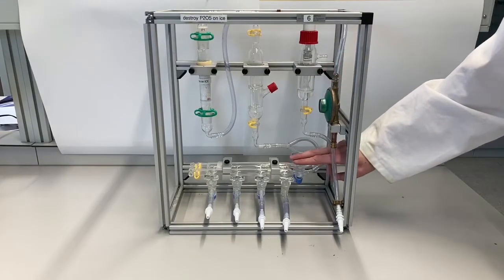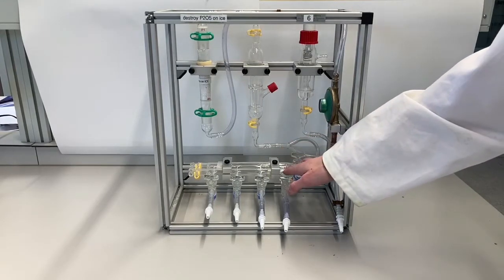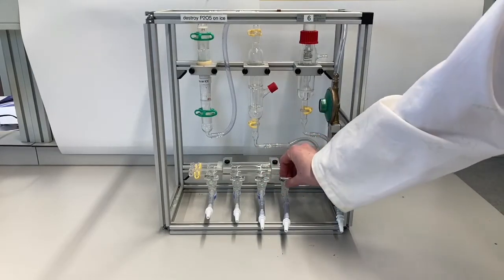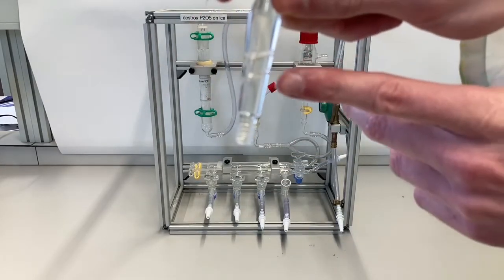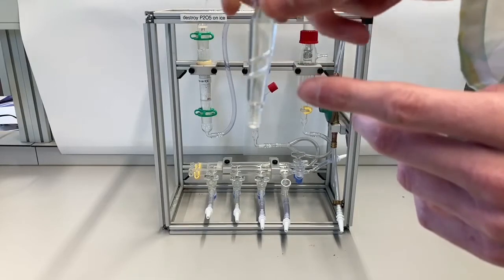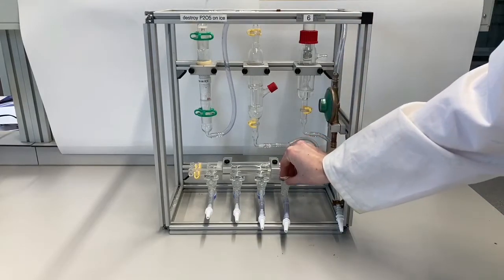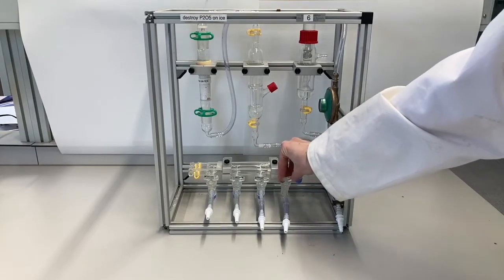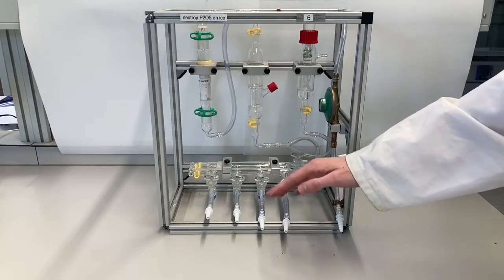The other thing attached to the double manifold is the vacuum — from your pump or the vacuum line — on the front side of the manifold. You can use these taps to connect either vacuum or nitrogen. One line connects the front to the bottom part if you rotate one way; rotating the other way connects the front to the top part. One side connects to nitrogen and the other side connects to vacuum. It is always a good idea to test which side of the tap is nitrogen and which is vacuum before attaching it to your reaction.